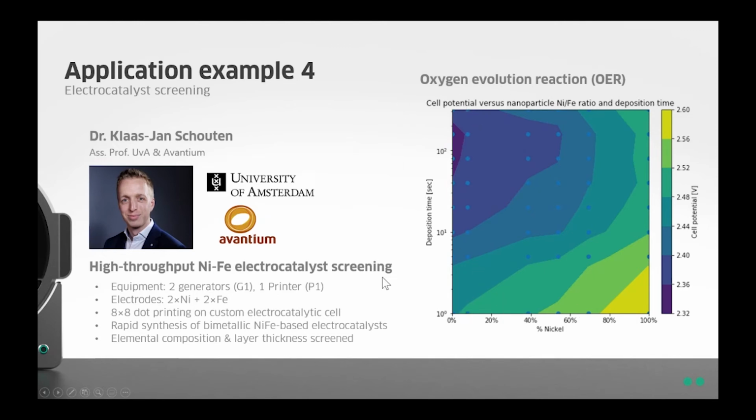What we proved is that within almost an hour, we were able to synthesize 64 new compositions, fully automated by using this printing platform, which I think is very interesting and also needed to accelerate the development of new electrocatalysts.